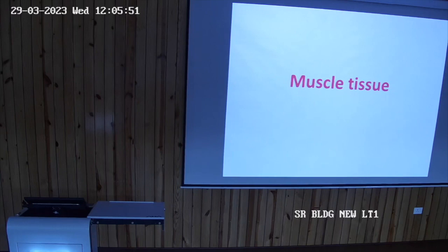See the slide properly. After one month, the lab will start. The enumeration of the lab will be completed within one month. Then every student will have the microscope and the slide box. You have to focus on the slide and see each and every point which we teach you. So don't go into confusion. See the slide properly.